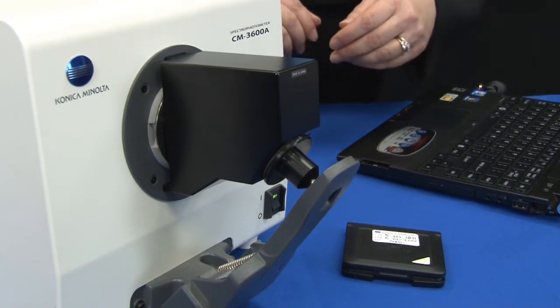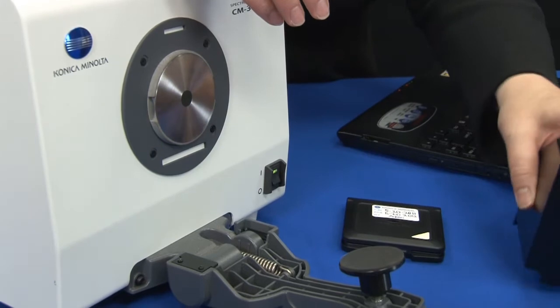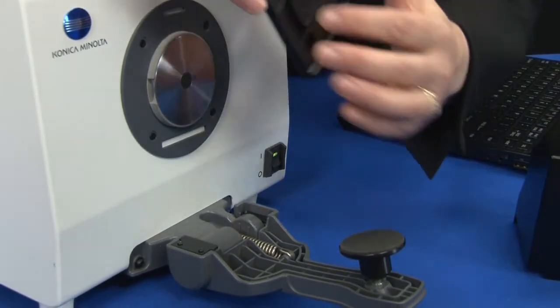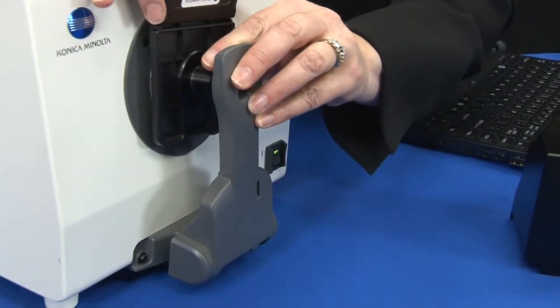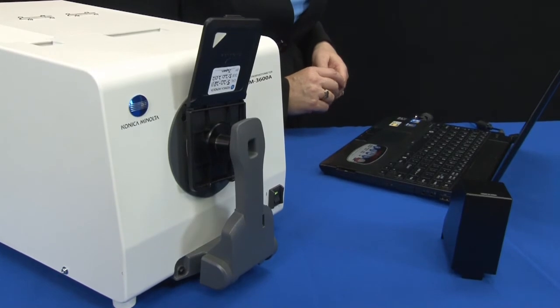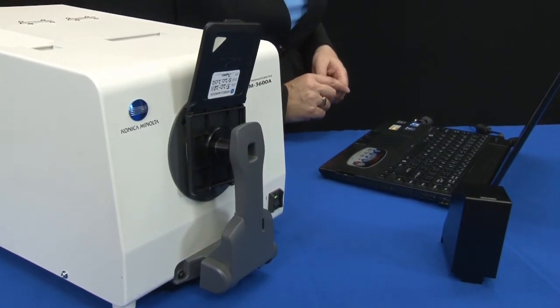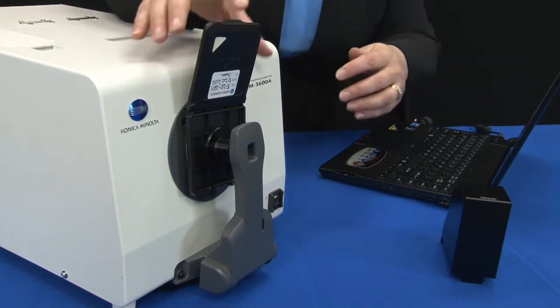The next measurement is with a ceramic white standard with traceable values. The measurement of the white ceramic standard must always be performed with the standard that was assigned to the instrument. Each white standard has a serial number and is easily paired with the correct instrument. Both the zero calibration and the white calibration readings are used to set the instrument to a known state of calibration.